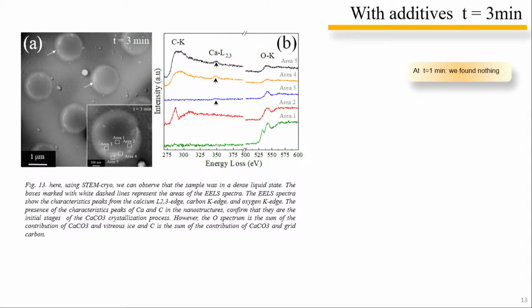With additive, 3 minutes. We can observe that the sample is in a dense liquid state. At 1 minute, we saw nothing.